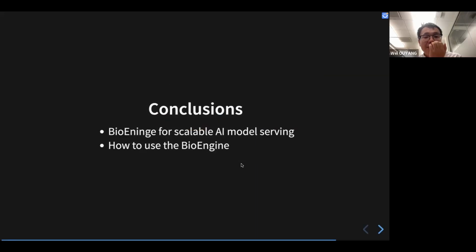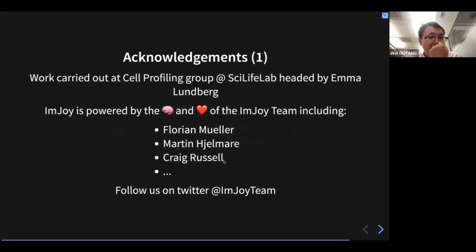Yeah, I think that's mostly it. I hope you now know how to use BioEngine, and feel free to try it. We also have this notebook provided. Feel free to try it more, and if you have any questions, let us know. Feel free to reach out.